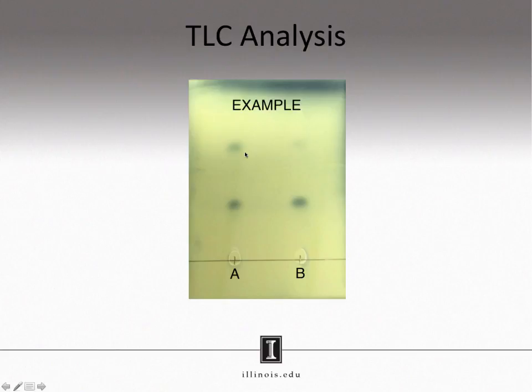You will notice that this plate is green. In order to visualize these spots, you'll be using a new method of TLC visualization. You'll be staining your plate using a stain called phosphomolybdic acid, or PMA for short. Simply follow the instructions in your procedure.